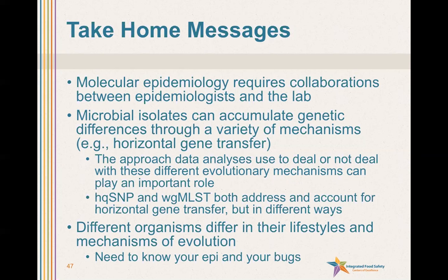Now, the important thing is that as we apply these tools to other organisms that we may not have worked with, organisms with a different lifestyle, and I explained to you that the number of generation times that an organism duplicates can be very important in terms of the number of differences accumulated, we may have to reevaluate how we deal with these data, how we interpret these data, and maybe even what analysis we use.